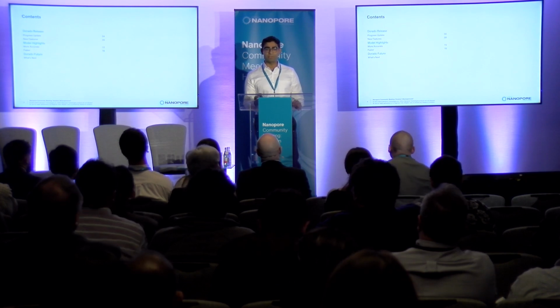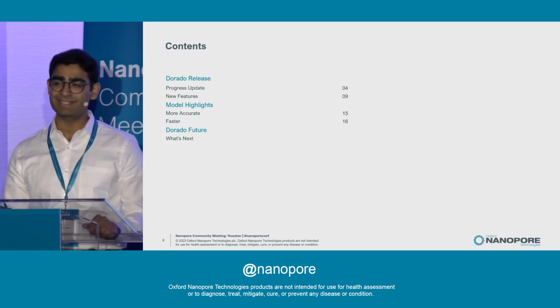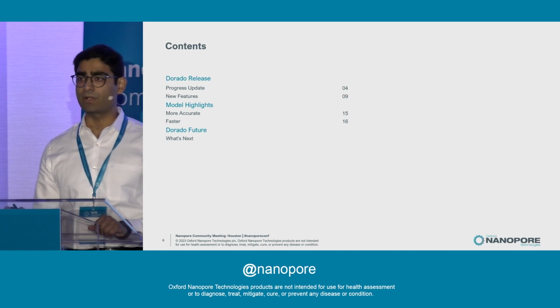So I'll be going over a new Dorado release and talk about some of the work we've been doing in Dorado over the last few months to make it faster, more accurate, and easier to use. Then I'll share a bit more about what we plan to work on next.